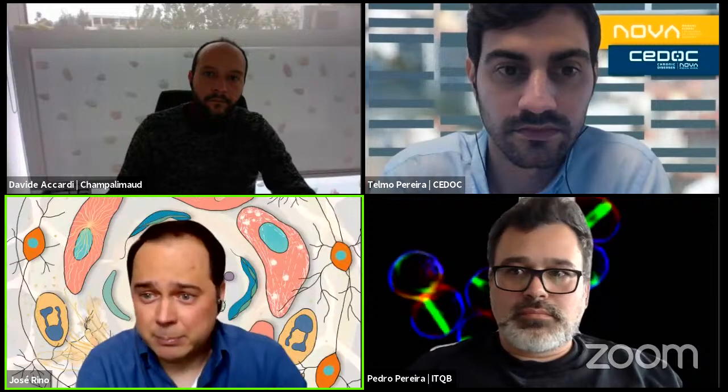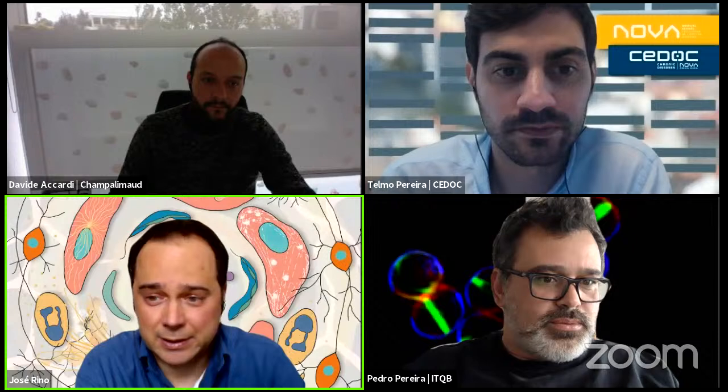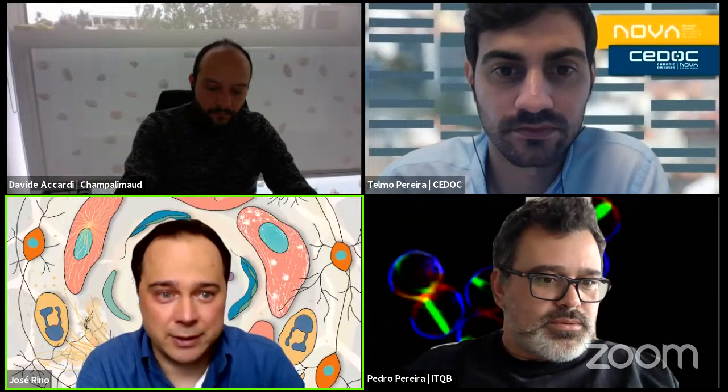My reply would be, don't use these stainings. Don't go for two green dyes. Choose a green and a red dye. Try to have them spectrally separated so that you avoid trying to go with very specific narrow filters that will cut down your photons a lot. Unless you really have to use this and we have to go into spectral unmixing and things like this, my advice would be to just pick fluorophores that are really spectrally separated: green, red, far red.